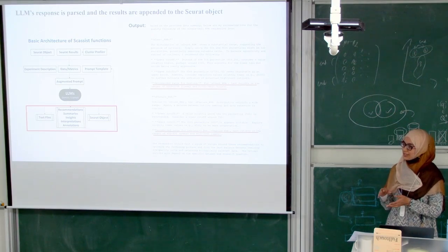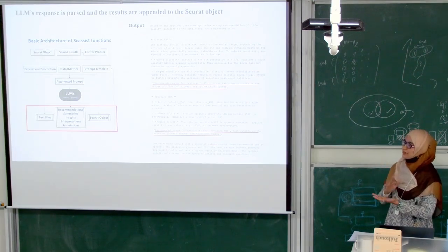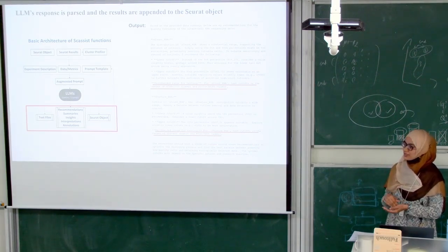It can have graphical data too. We can think of it as a container that can contain every version of the analysis that we are doing, and it can access the information from that too.